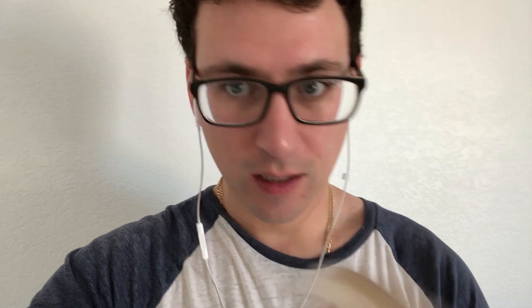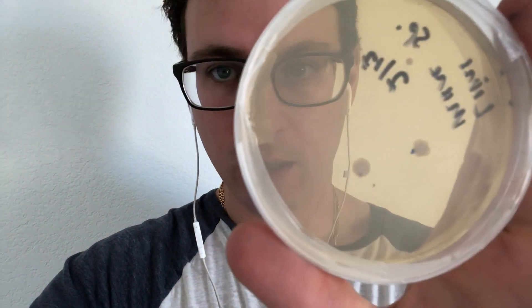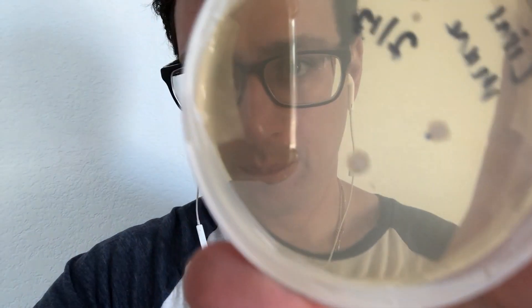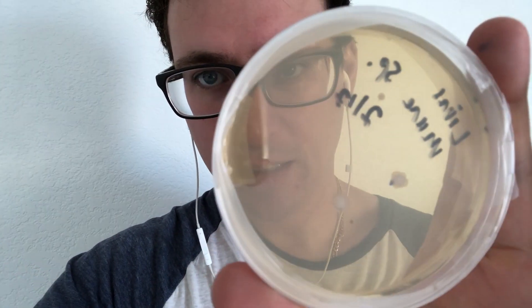Nothing too exciting today — we're still looking at clean plates. But there is a little bit I wanted to go over as far as the bacterial colonies. That lion's mane that I plated or streaked out with the three bacterial colonies has started to grow a little bit more, and I can get a close up. You can see those colonies right in the middle.